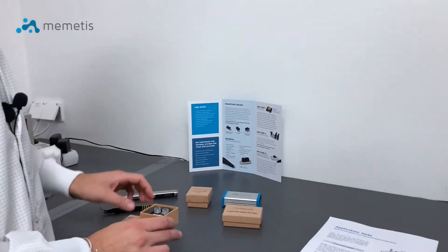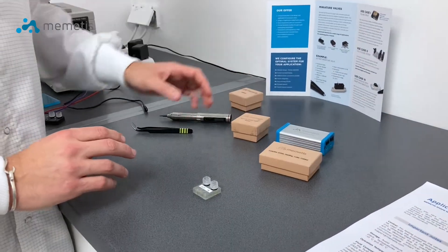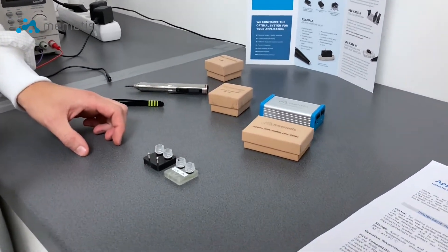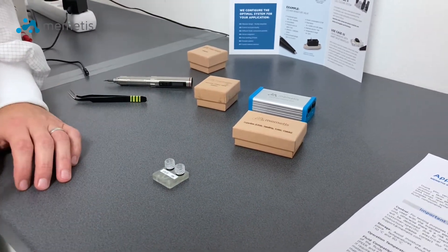First, you will need to unbox the fluidic connector blocks. Depending on your material requirements there is also a 3D printed version available. But now let's focus on the regular one.